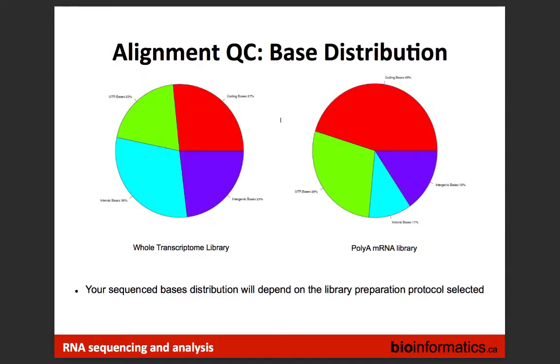Base distribution: looking at all aligned bases, what percentage are coding, UTR, intronic, and so on. This gives you an idea of what library was used. If you're unsure whether whole transcriptome or poly-A selection was used, this plot reveals it. For poly-A libraries, you expect a lot more coding bases than for whole transcriptome. If something looks strange, go back and talk to the people who prepared the libraries.